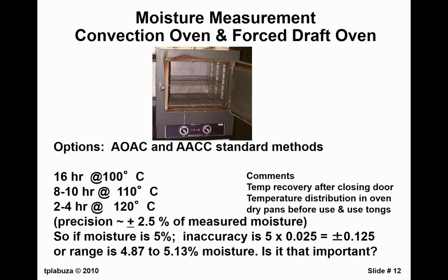precision of the instruments. The simplest way to do moisture content is to take samples, weigh them into pans, put it in a cabinet. And this has got, you can actually put 3 racks in here. Put it in a cabinet at a given temperature, some high temperature, and you hope there's some convection in there so that the samples dry out.